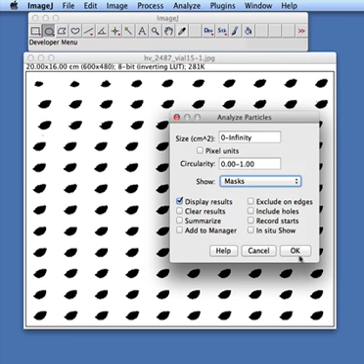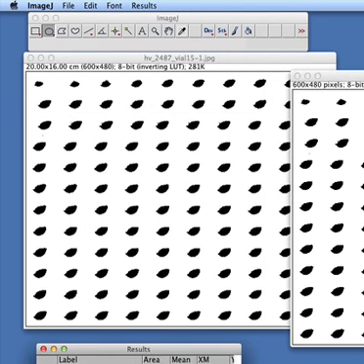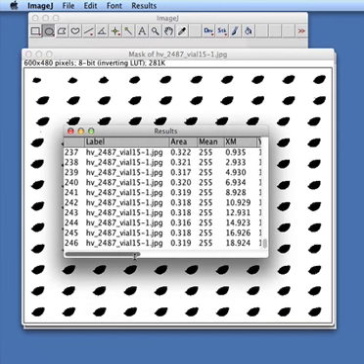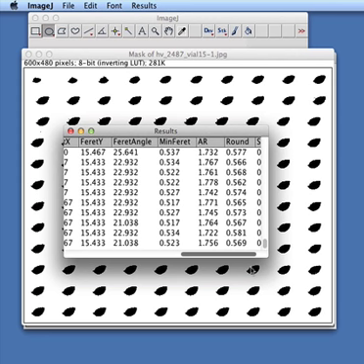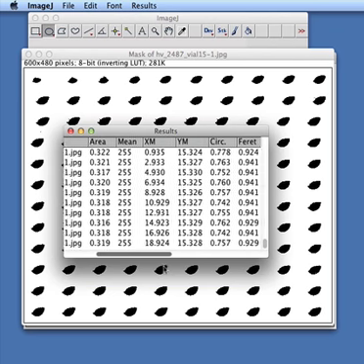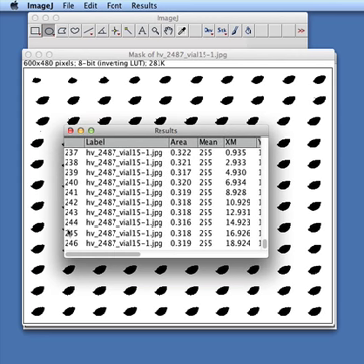I'm just going to go by masks this time just to show a different look. This is the information that you can then copy and paste into Excel and work up. We have various shape factors, roundness, Feret diameter, and in this case it's the area that's particularly important. But remember, again, it's mislabeled the 1 through however many particles we have, and so that has to be corrected.